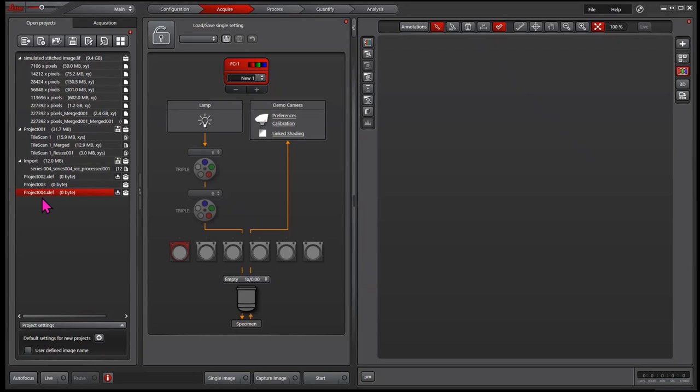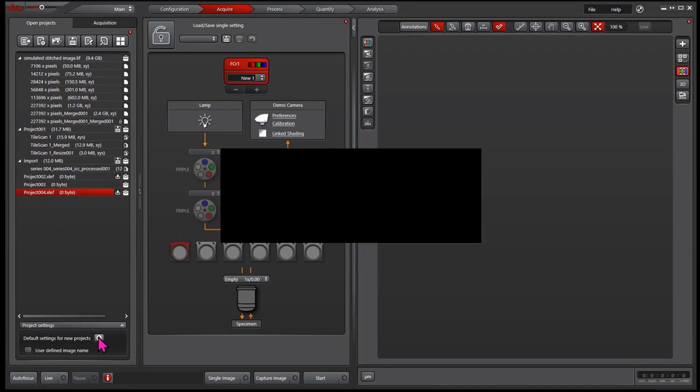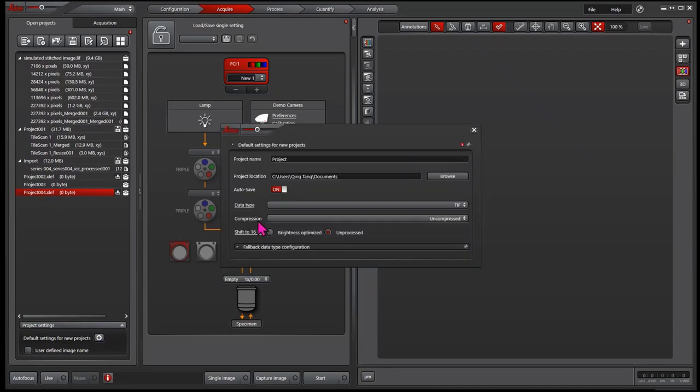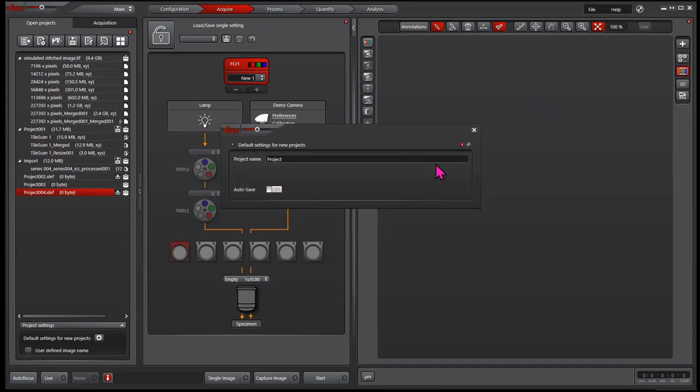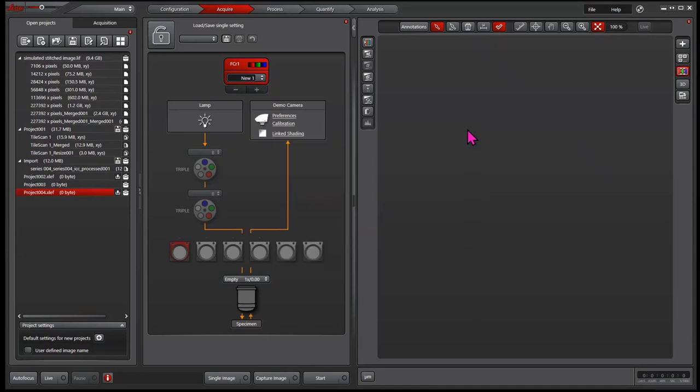So now I go back to the Leica image file format and talk about how to handle the large image files. To go back, I simply click the plus sign again and uncheck the autosave. Make sure when you switch between file format, always create a new project file.